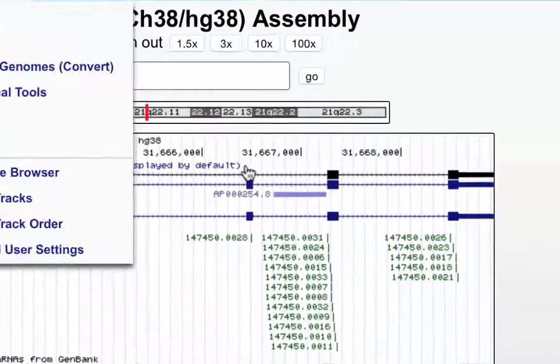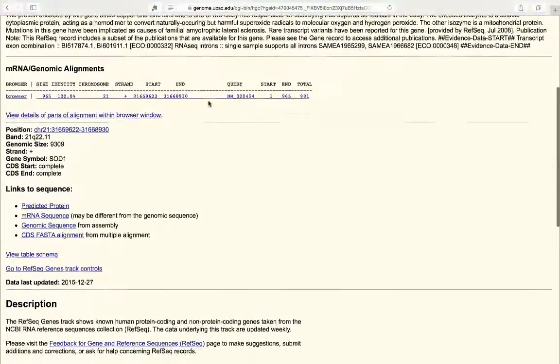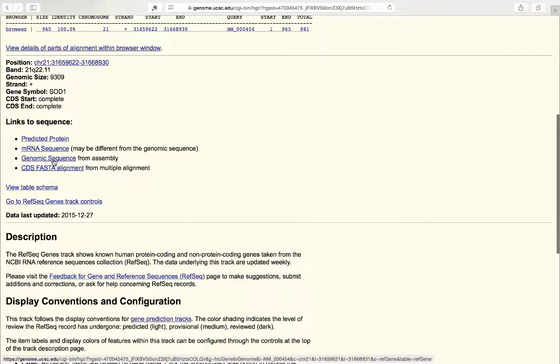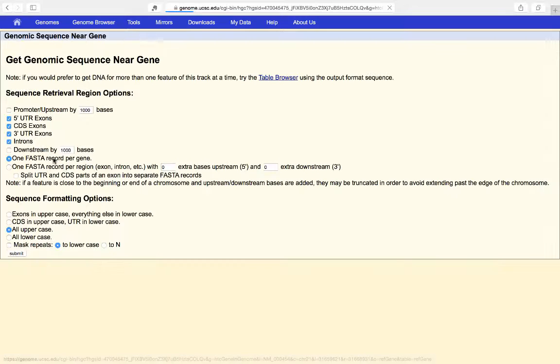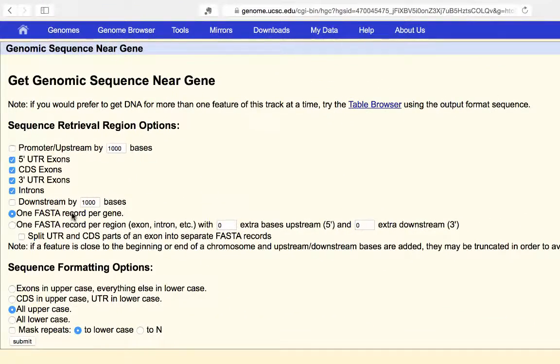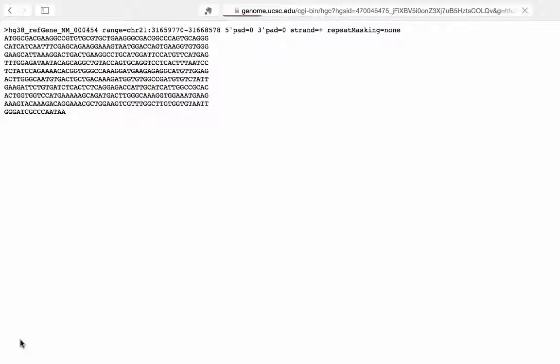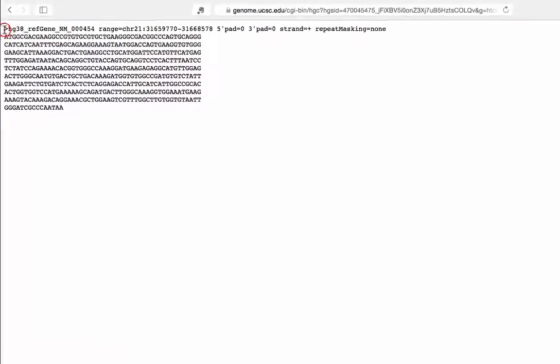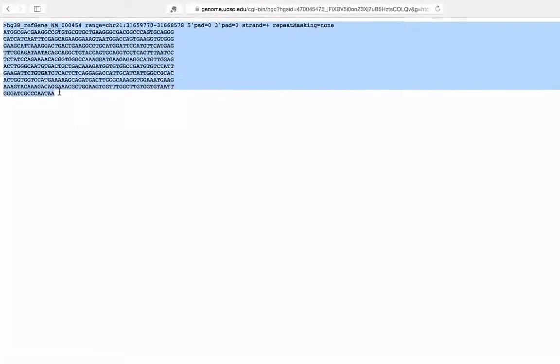Another way to get DNA is to click on the gene itself in the RefSeq Genes track and select 'Genomic sequence from assembly.' Here you can select different options: upstream bases, only 5-prime UTR exons, only coding translated exons, etc. I'll turn off 5-prime and 3-prime UTRs, turn off introns, and select one FASTA record per gene — giving me the SOD1 gene exons only, with no UTRs.